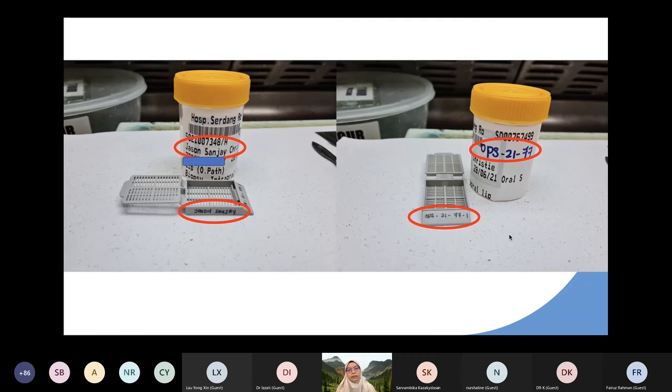Okay, let's see here. I want to show you the safety measure that we take when handling the specimen. Lab numbers that we assign to the specimen will be written on the tissue cassette as well as the patient's name on the side. In cases where the patient has multiple specimens or multiple bottles that were sent from one patient, the lab numbers assigned will be following the clinician's label.